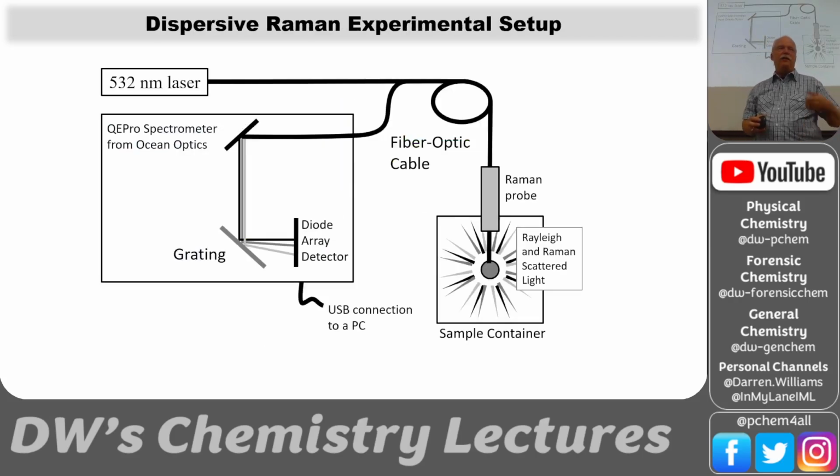Okay. We have a diode array Raman spectrometer. So we have a fiber optic, and that's the only thing that you can screw up in this lab. If you're in there playing with it, with the TAs, of course, just don't ever kink the fiber optic, because it's a glass fiber, and if you kink it, it'll break. Okay, so just be gentle with it.